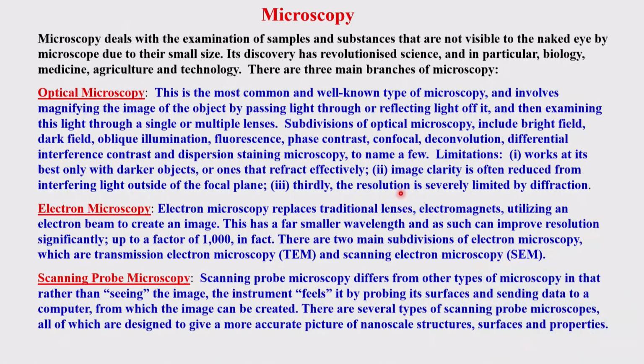This brought a need for a roughly matching wavelength, as well as magnification, both of these. And that is where electron microscopy comes into the picture.